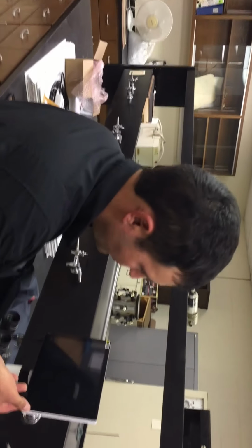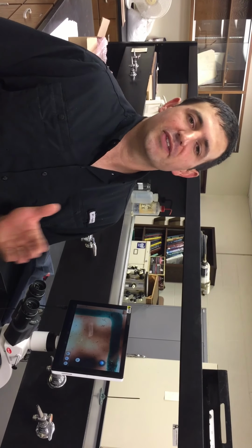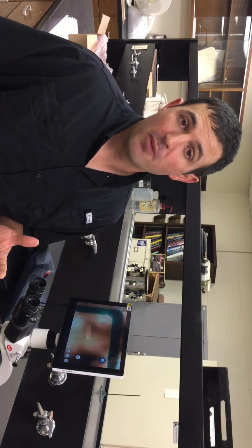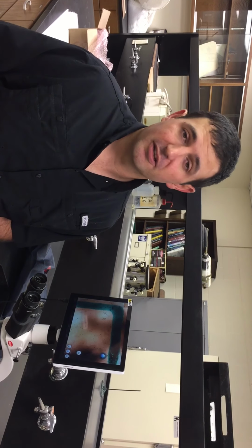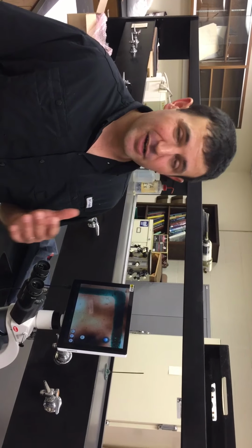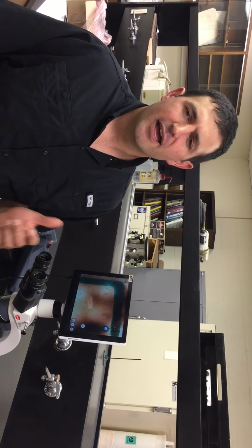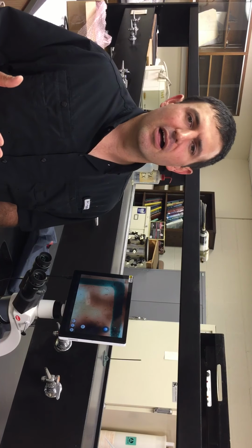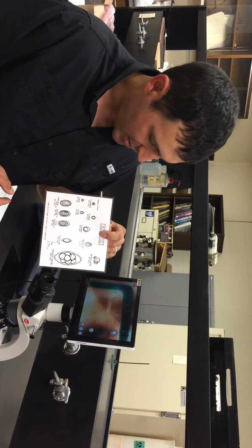And so what are we looking for? We're looking for specifically Haemonchus contortus eggs. Haemonchus contortus, or the barber pole worm, is the most damaging parasite to sheep and goats, particularly in this region. They're very prolific, and so we're going to count the number of eggs within this green grid, and that's going to give us an idea of, or an estimation of, the adult worms that are actually harming the animal within its abomasum.